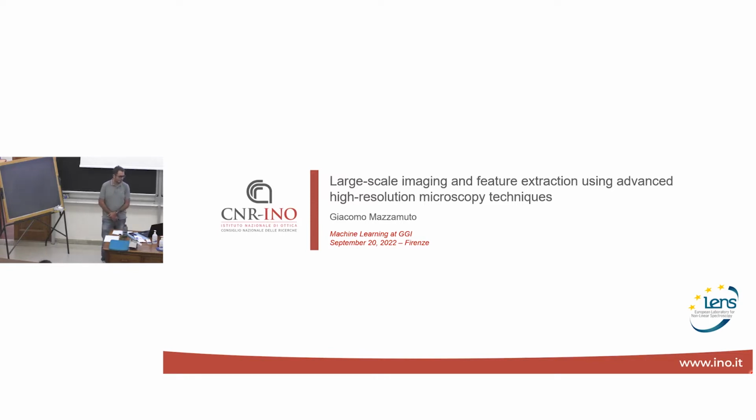interrupt whenever you like. Okay, thank you, Duccio, for the introduction, and good morning, everyone. It's great to be here in this beautiful hill of the historical headquarters of the physics department. And today I will give you a short introduction on high-resolution microscopy techniques for imaging of large biological tissues.